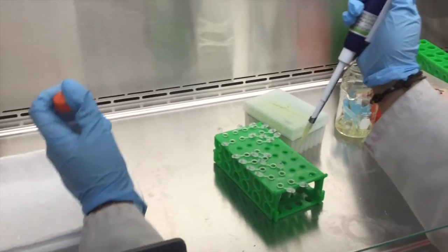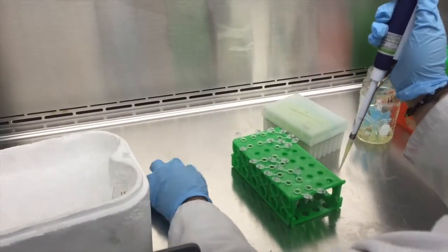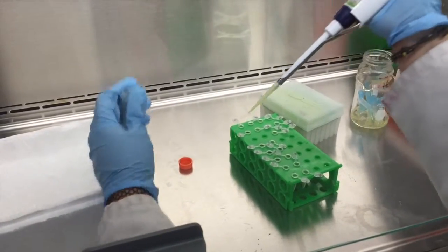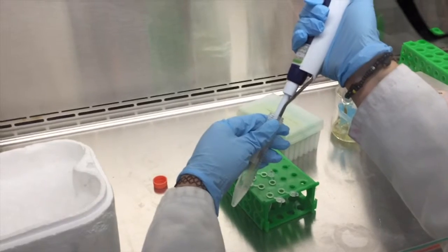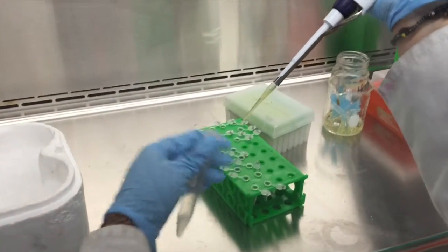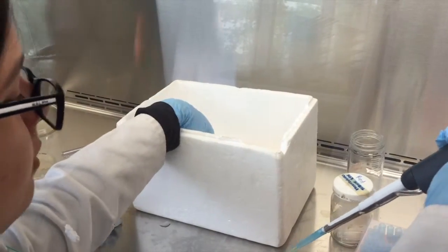For both electrocompetent and chemocompetent cells, different aliquots were made in order to preserve the cells to use them in some other experiments. 50 nanograms of a plasmid were added to the chemocompetent cells.